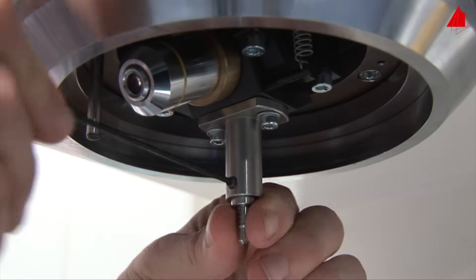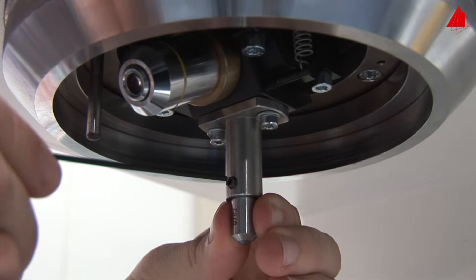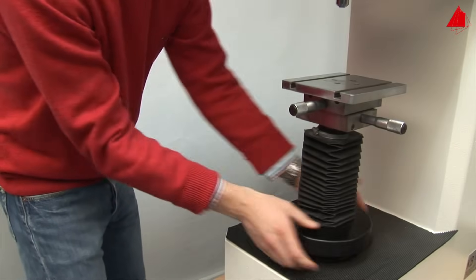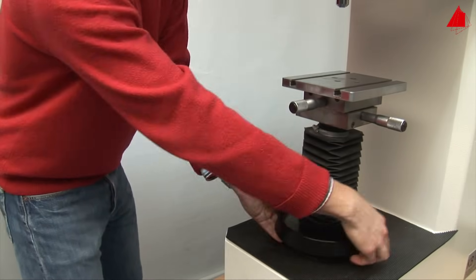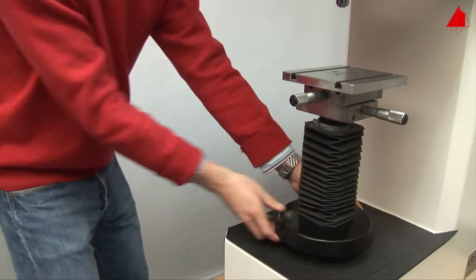It is also possible to select and exchange the indenter, so different methods of hardness testing can be conducted on the same testing machine. The support table can be adjusted in height, so the test piece can be positioned at the correct distance to the microscope lens and the indenter.